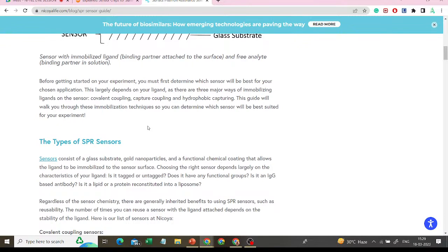Ionic and adsorptive based immobilization are not so common. The reasons are there, like your oligonucleotides can bind to your polyamide, but that can be reversed.